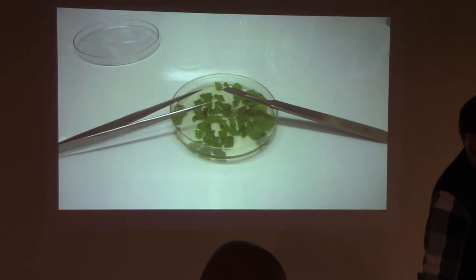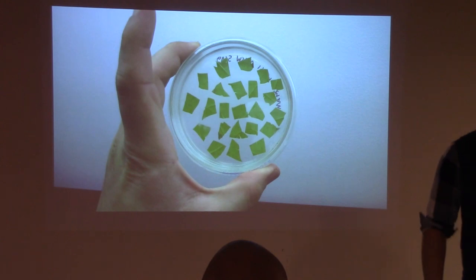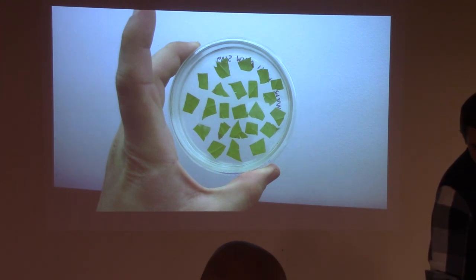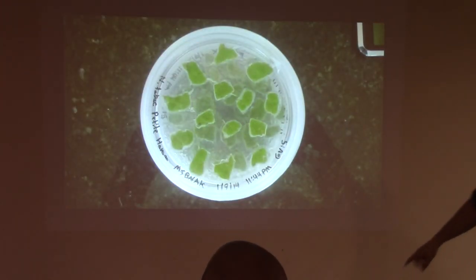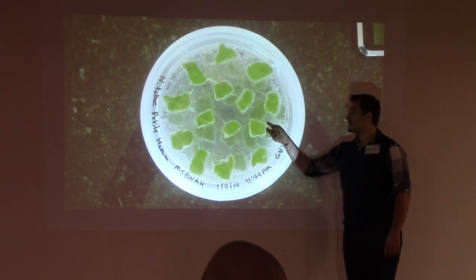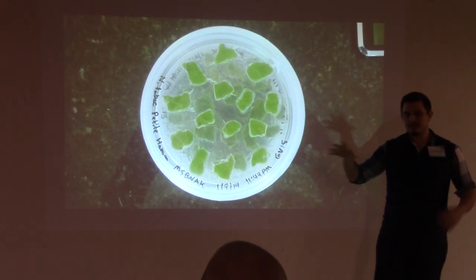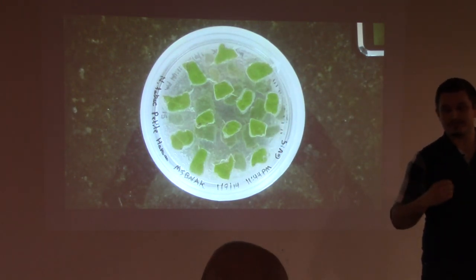So after that, you take those cells, you dab them with cotton. Everything is aseptic, and I'll explain during the demo how to be super sterile when this happens. So you plate them on an MS plate with no antibiotics, and then you wait 24 to 48 hours. Now you're starting to see this halo. So this halo over here is actually the bacteria growing, and hopefully doing its job. So after 24 hours, this is a good sign that the bacteria actually hopefully did its job.